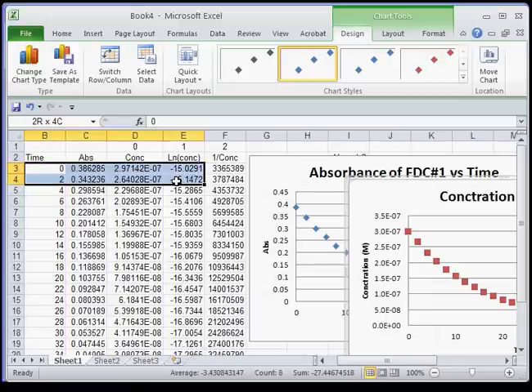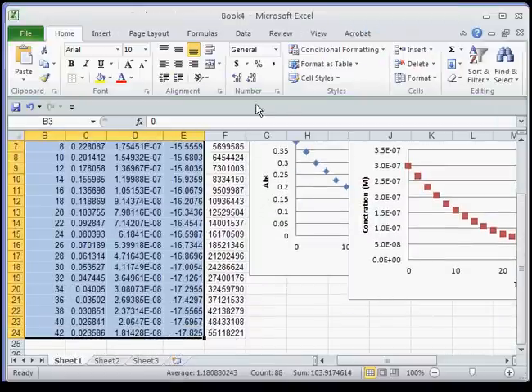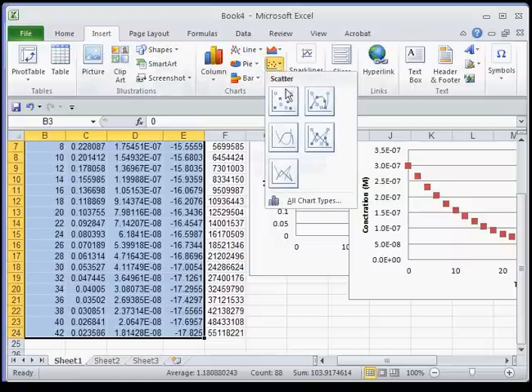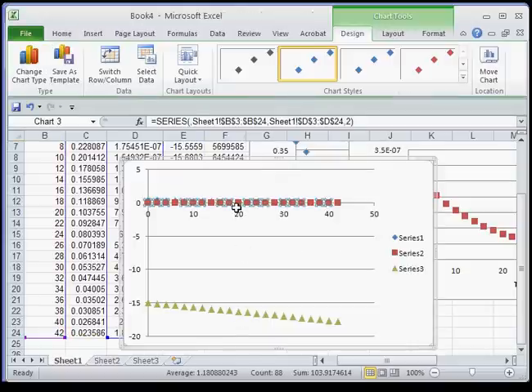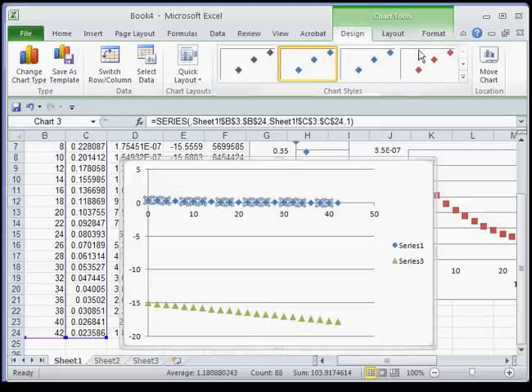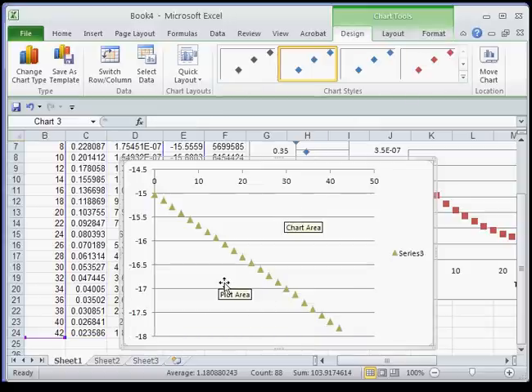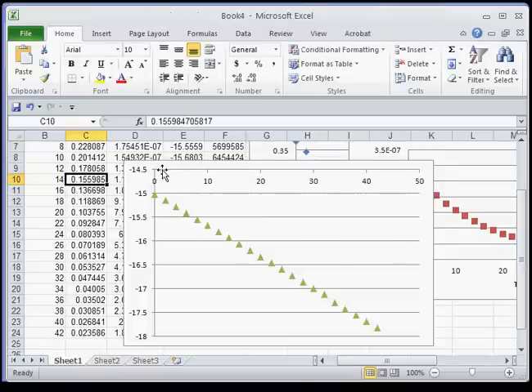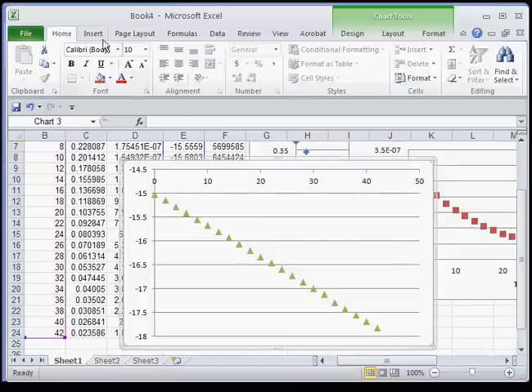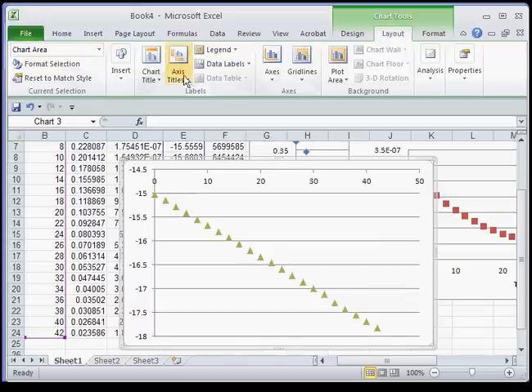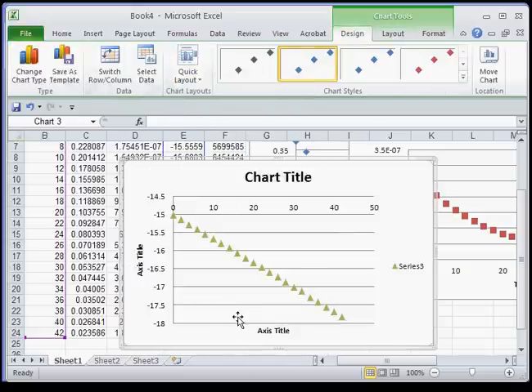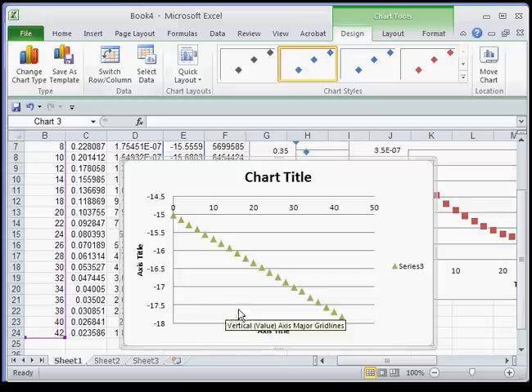Then we're going to do the third graph — the ln of concentration. We're going to Insert a scatter plot. Get rid of those series. You'll notice that's a really nice graph. Go to Chart Tools, Design, Quick Layout, and then you can fill in the information you need there.